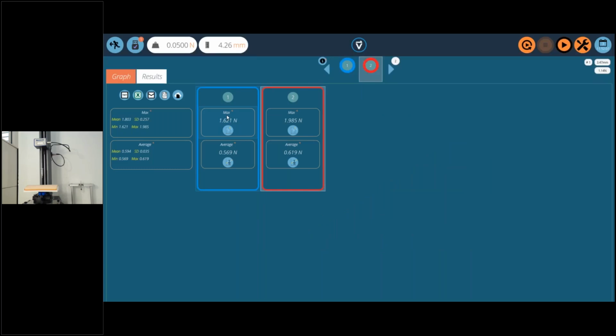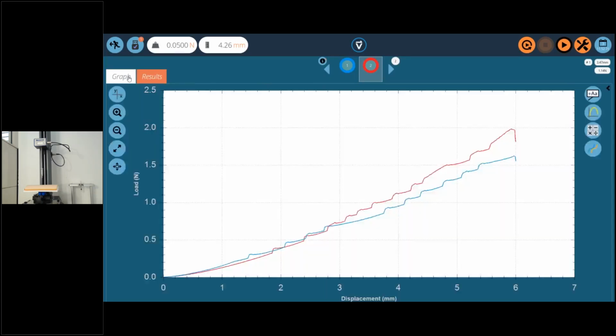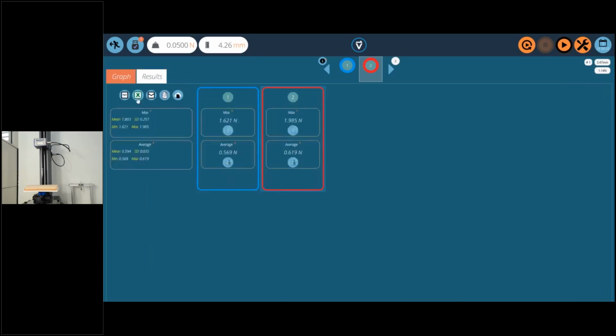Now, what I am personally suspecting is that because the layer is slightly thin, it may start spiking as it gets to the base. But again, this is a proof of concept to show how you would measure these. The key is obviously to pick a material and stick with it to maintain consistency. So again, there are additional parameters for the ability to export your data, create testing reports, and so on. And that pretty much is what these two tests look like.